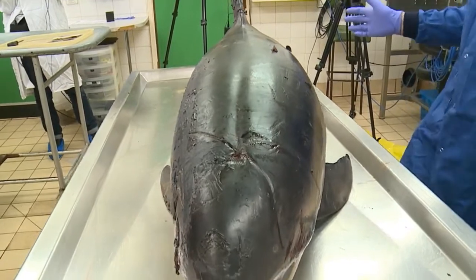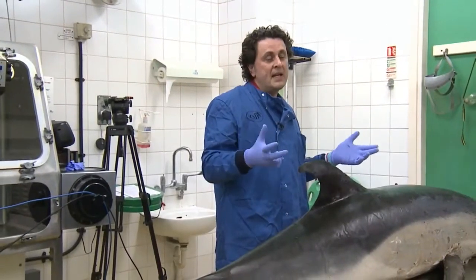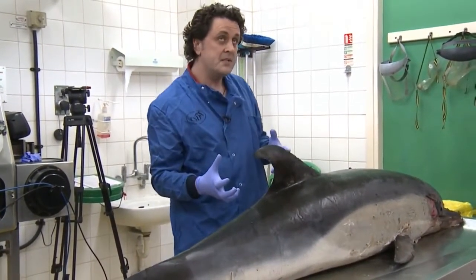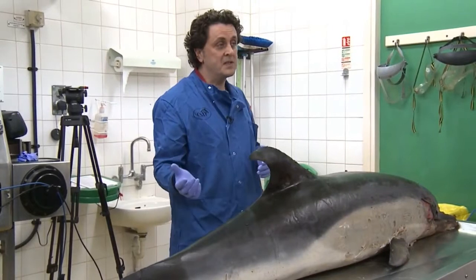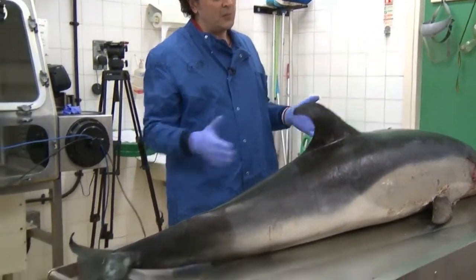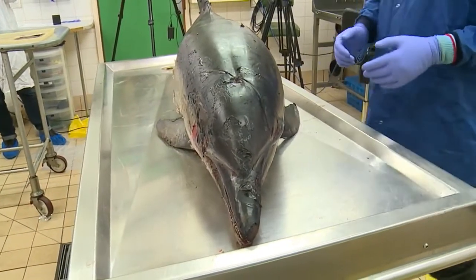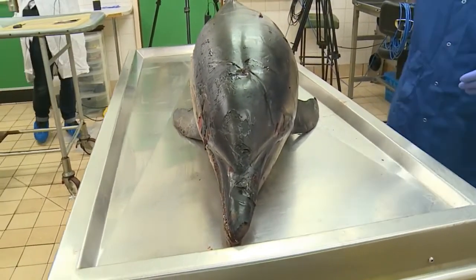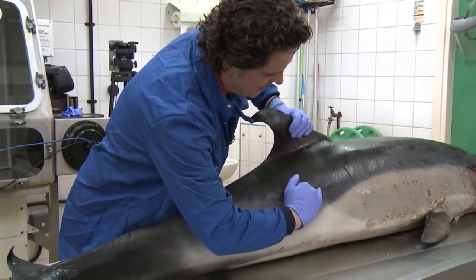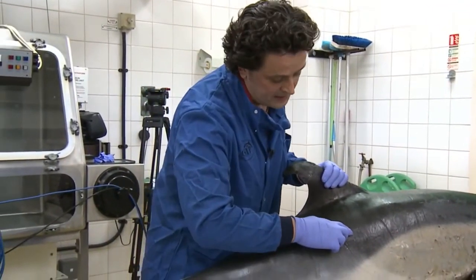This is a juvenile on the basis of length. They're born May to September-ish, and they reach sexual maturity about 10 to 11 years old. Maximum lifespan is about 35-ish. On the basis of length, because we've seen a lot of them before, we'll probably say this is a juvenile animal. Okay. What we can see, very obviously from the outside, well, let's deal with some of the natural marks first of all. Over here, if you have the camera on this side, this oval lesion, this is a tattoo lesion, it's nicknamed.